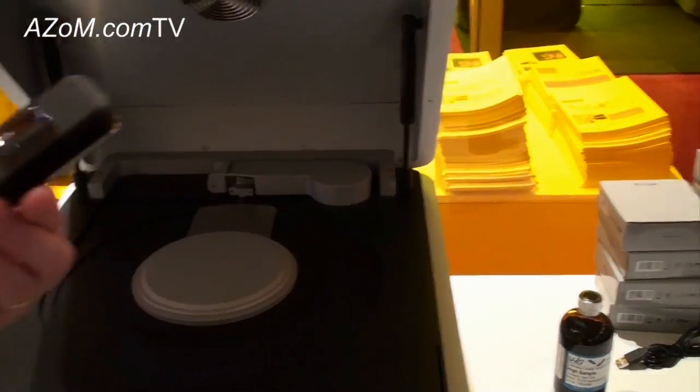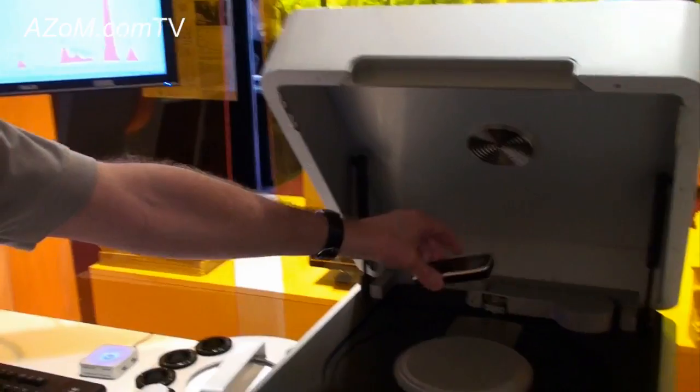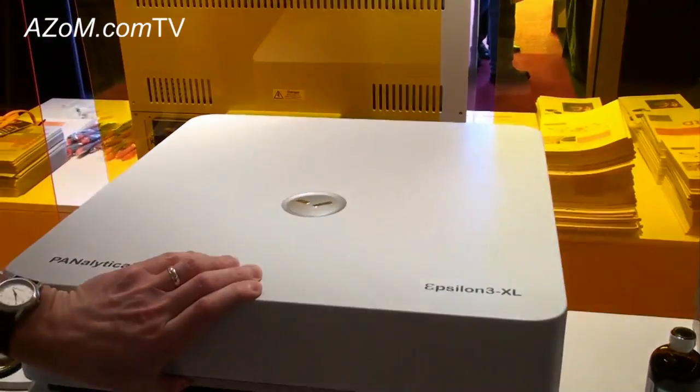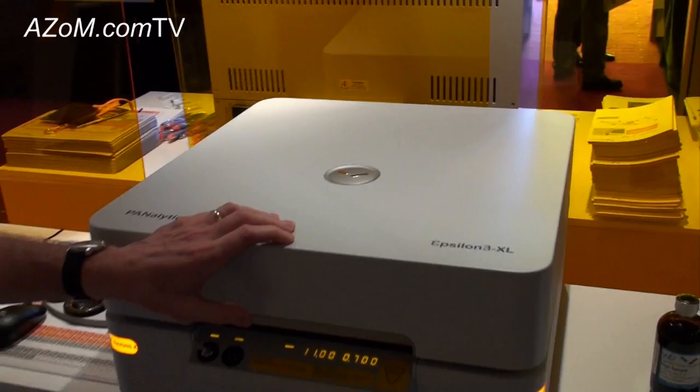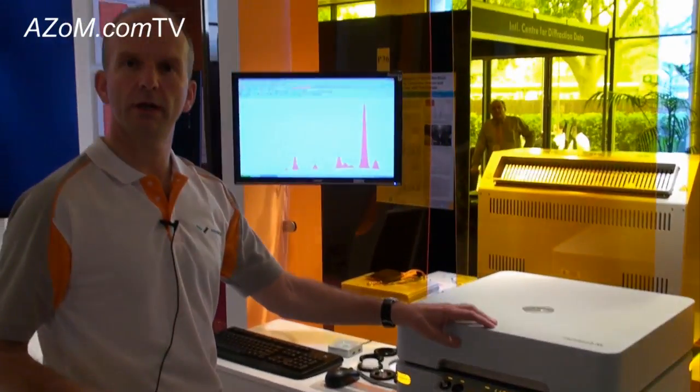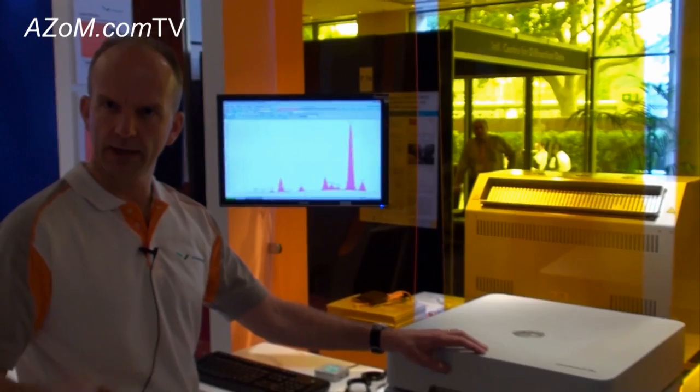For example, if I were to take my mobile phone, I could place it over the measuring position like so, close the lid, and then I would be able to do analyses of elements which are perhaps of relevance to the RoHS directive: cadmium, lead, bromine.